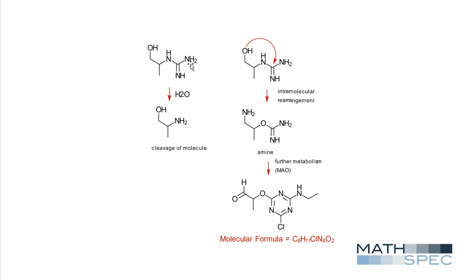So basically, this is just a part of the atrazine ring system, and if we hydrolyze that with water, attack here, we're going to generate an amino alcohol, and we're going to lose the side chain.